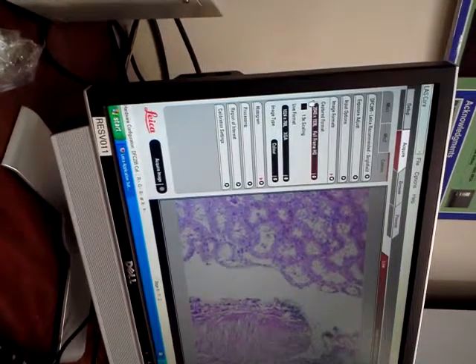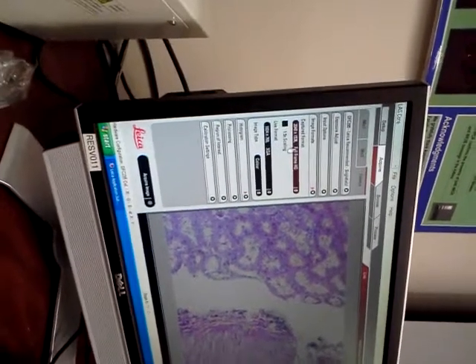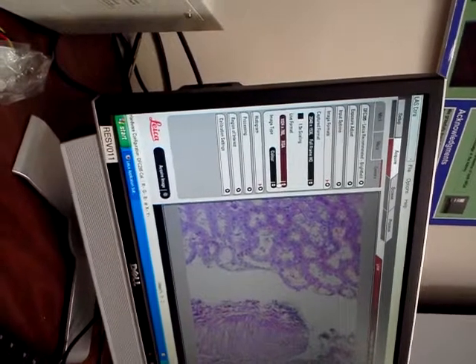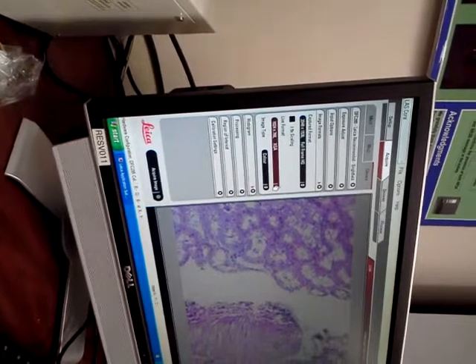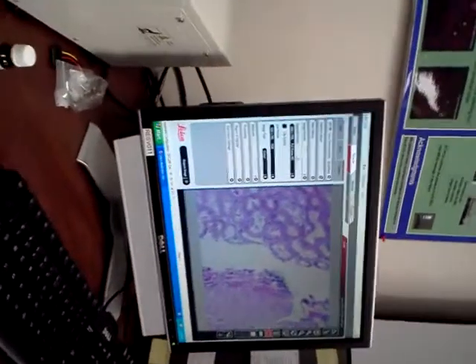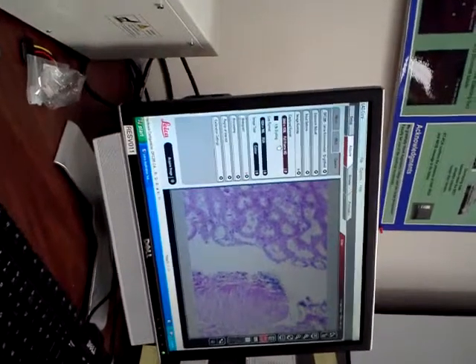Image format, so you're going to capture at your highest resolution, but we're looking at the live image at about half of the full resolution, just to get a faster refresh rate. We could match our captured format if we wanted to. It would just be slower.